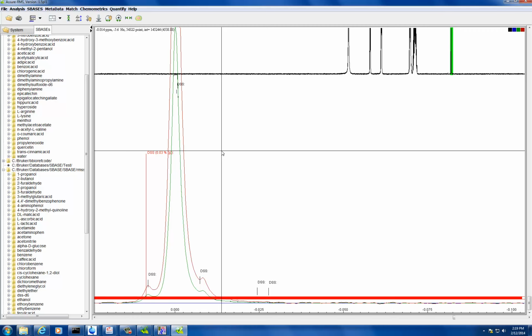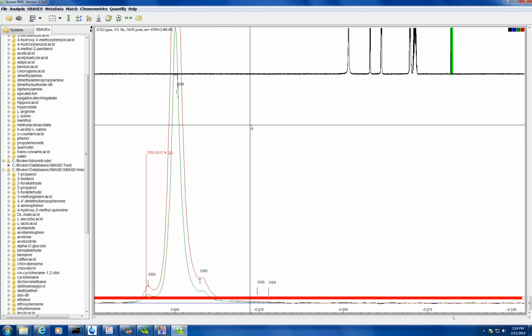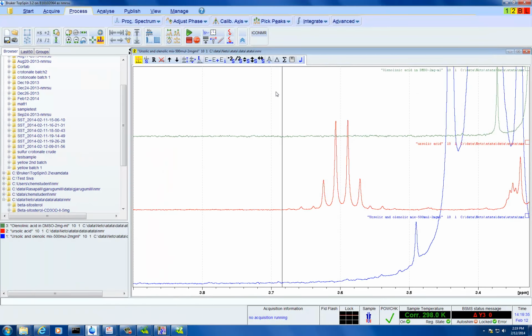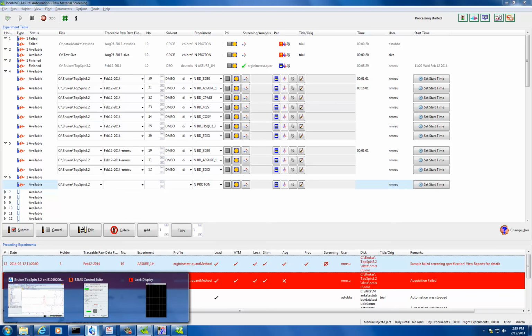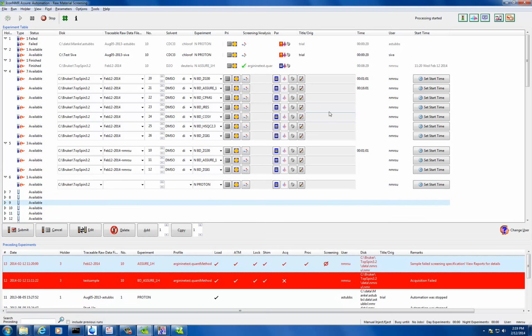So we are done with this part now. Let's go to ICON. We're going to go through ICON, so let's open it. Just go to any of those samples, any one that's empty. Scroll down, any one of those, and double click it.